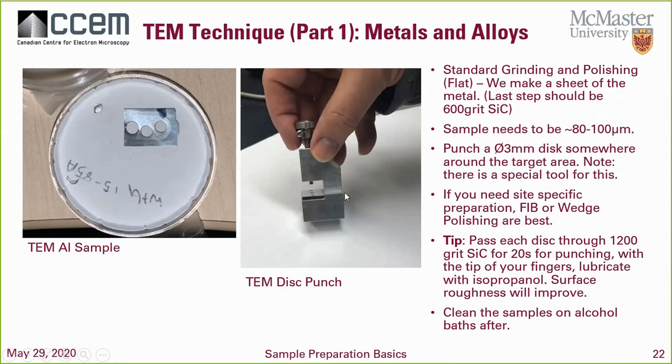Because these punching tools, now you can see one here. This is a small one. Other companies have ones with a little bit more of a lever where you can just press the lever and the tool will come and punch, but this one here is a more manual piece, so you can see the thickness. You don't want to ruin this tool, so the thickness is extremely important. You want to punch that 3 millimeter piece, as you can see here, okay?